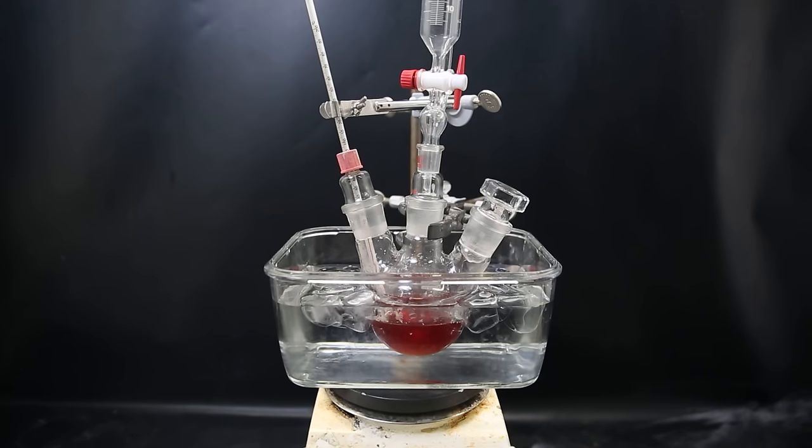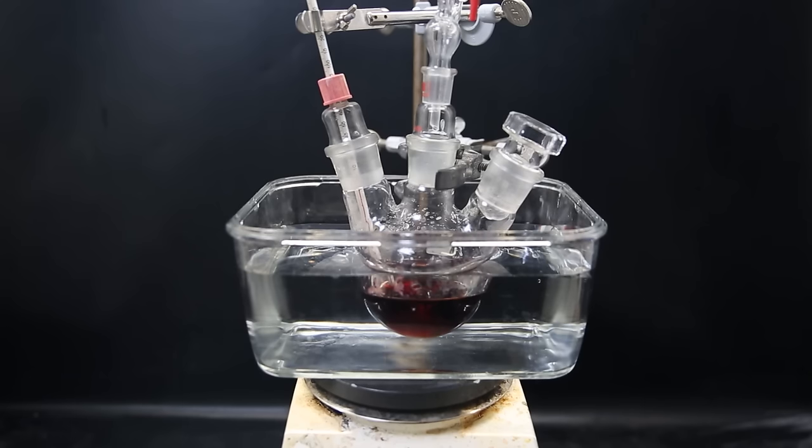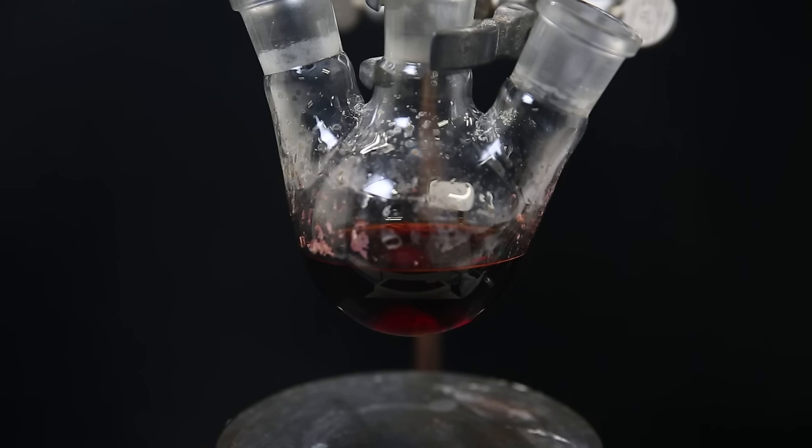The mixture has turned red, and most of the solid has dissolved. I leave it to stir overnight to make sure the reaction is complete. And when I come back, it has become even darker. I dismantle the setup, and we can see the color is similar to the insides of a cat.